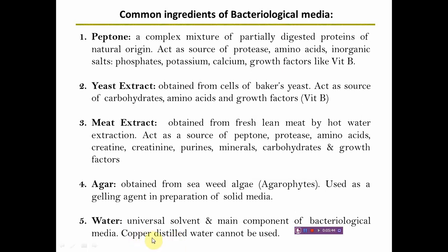The copper is lethal for bacterial growth, and that is why sometimes it is specified on the dehydrated media bottles, with an asterisk, in the instructions: avoid copper distilled water.